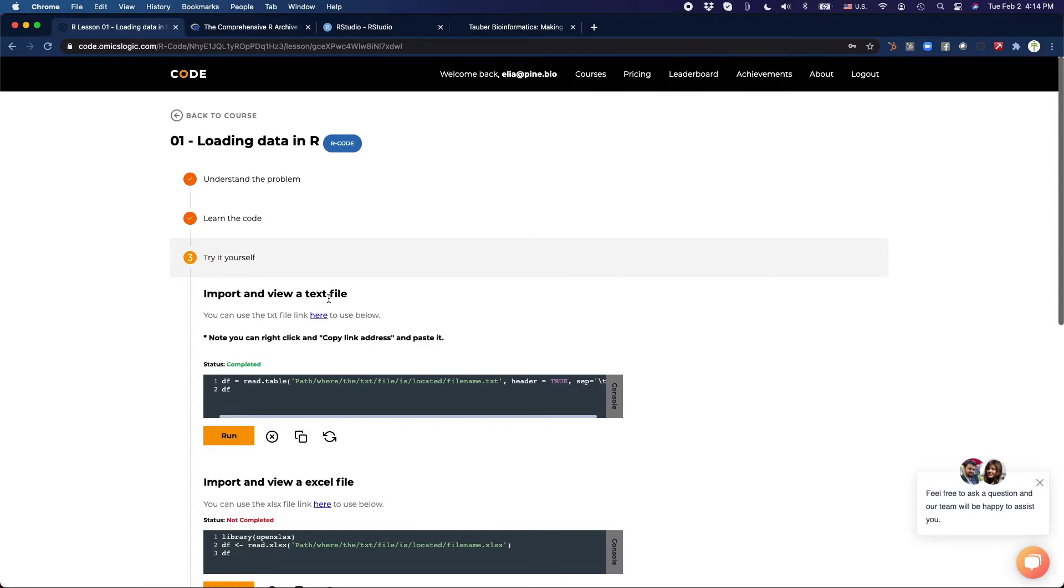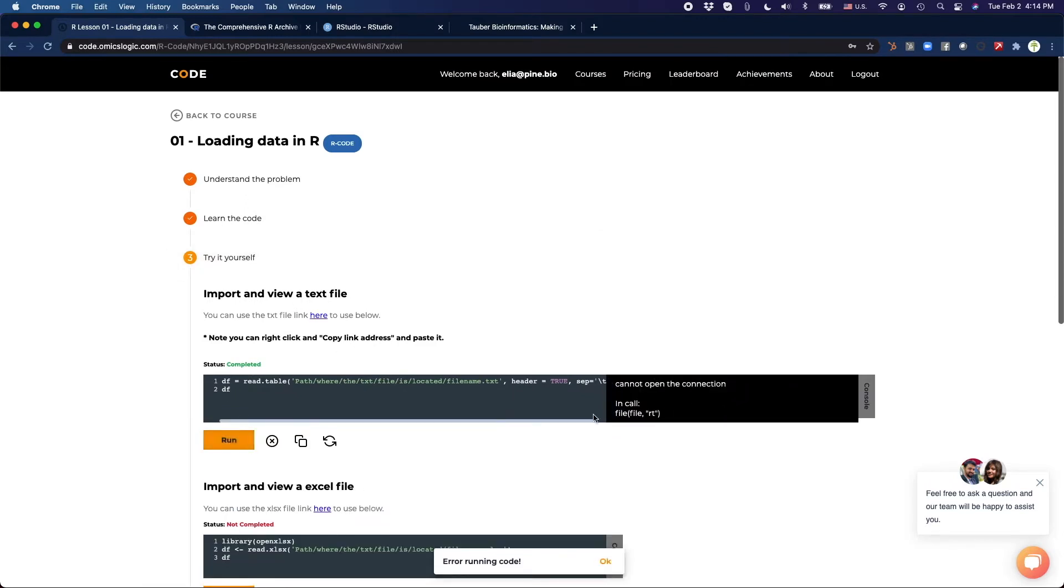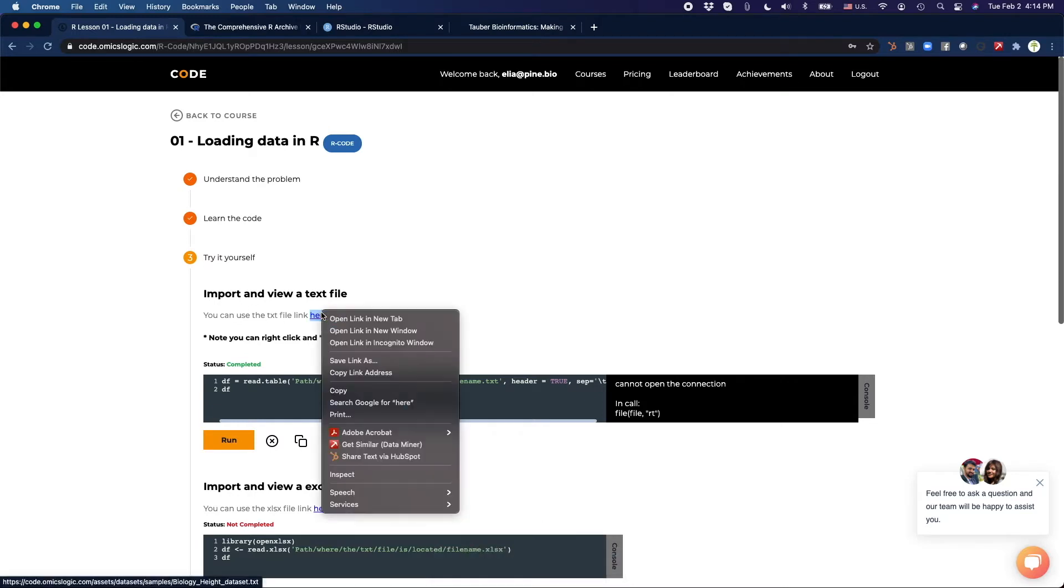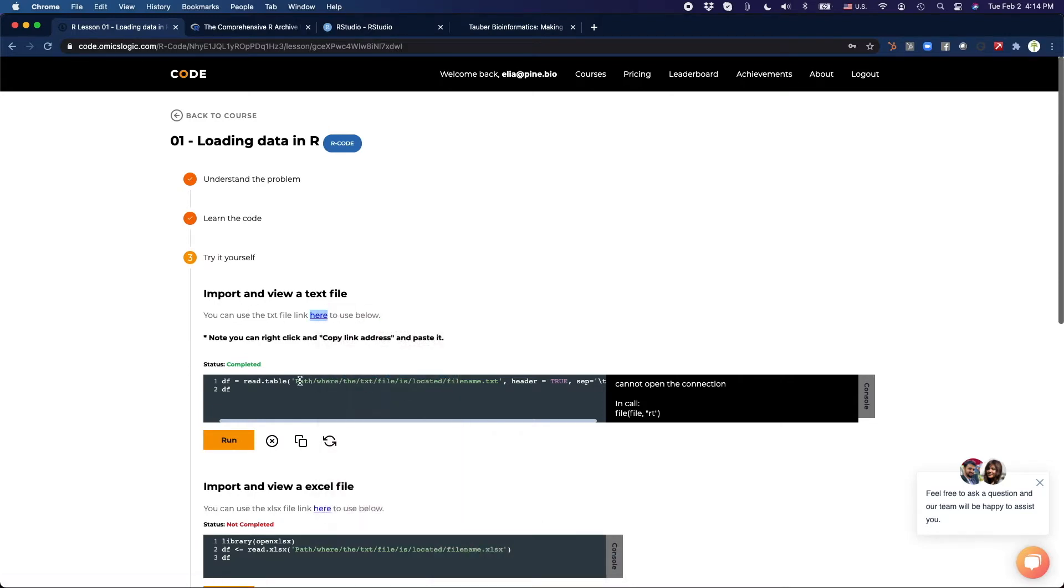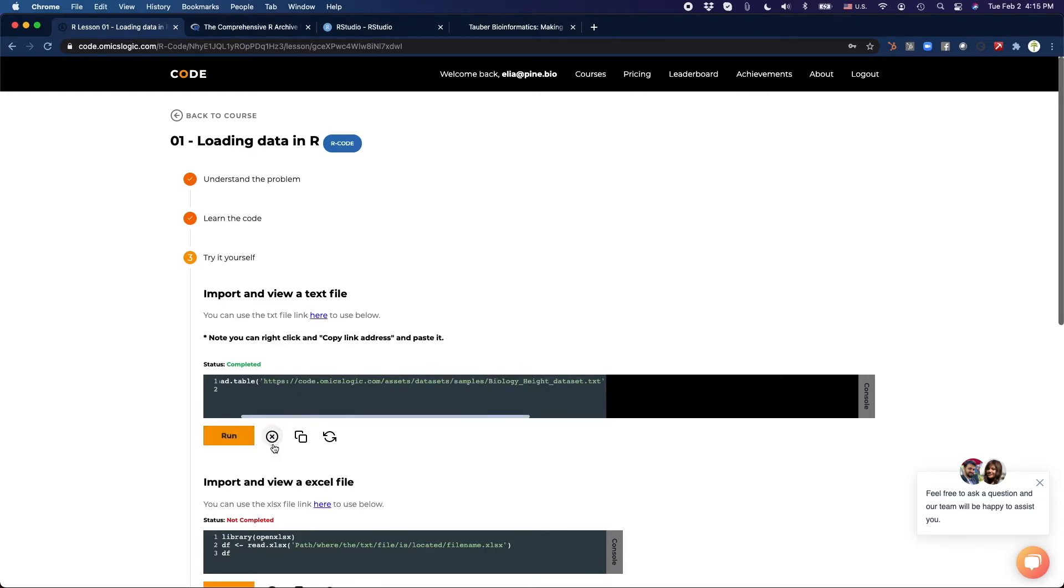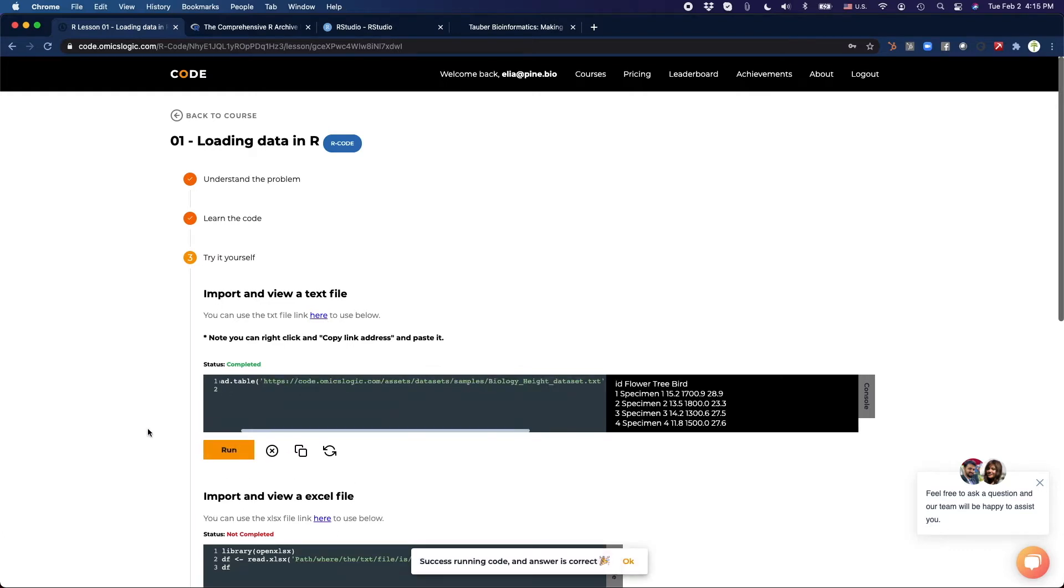Importing and viewing a text file. Let's run it. Enter running code. Why is that? We need to read the instructions. Let's copy this link, replace it here. Let's clear. Run it again. All right, great. Now we're successful.